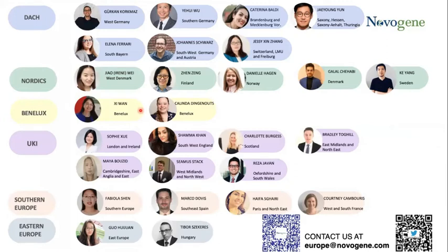Anna has asked, what are your platforms for sequencing? Okay, so the major platform that we use is the NovaSeq 6000 platform. We also have the S4 flow cell and the SP flow cell. That's the major platform that we use.